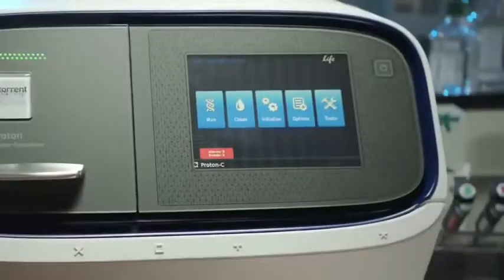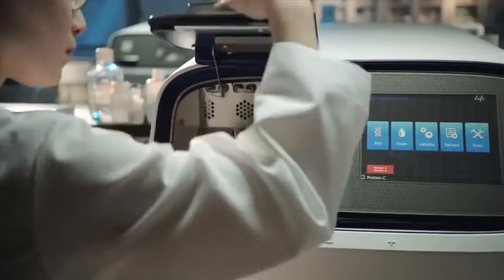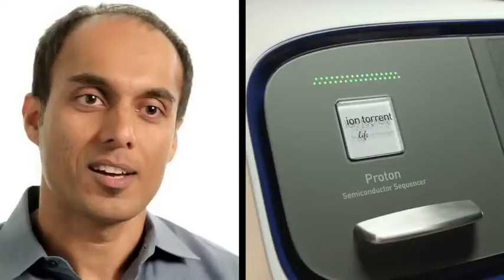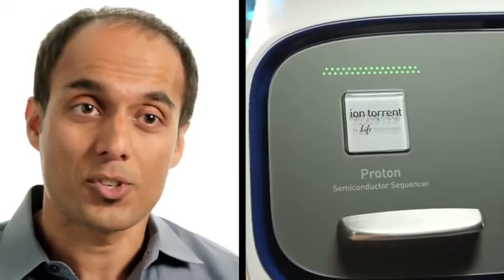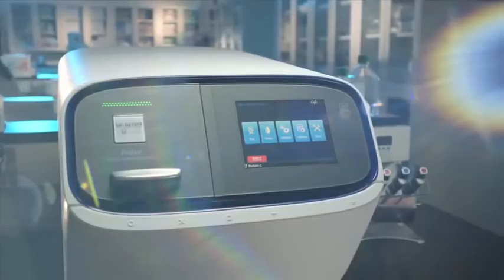Now at IonTorrent, we're leveraging decades of semiconductor technology and computing advances, as well as the same simple pH-sensing chemistry of the Personal Genome Machine. This is going to allow us to do the $1,000 genome, which has been the holy grail for the past decade, and allow us to do it in just a few hours on a benchtop device anybody can afford.